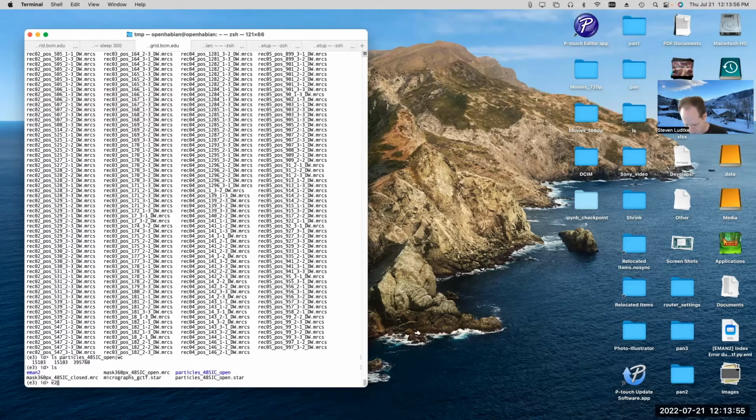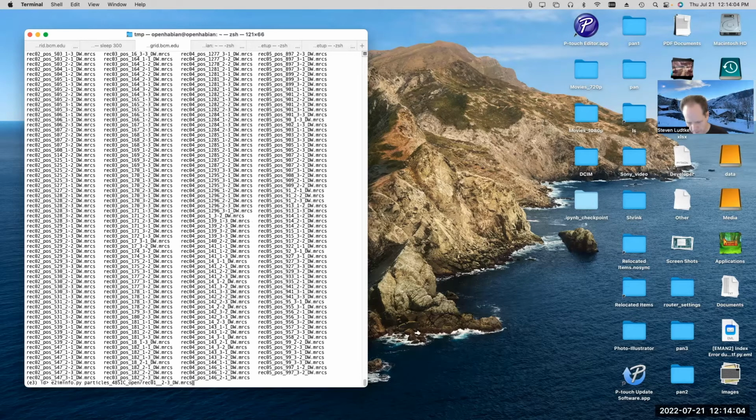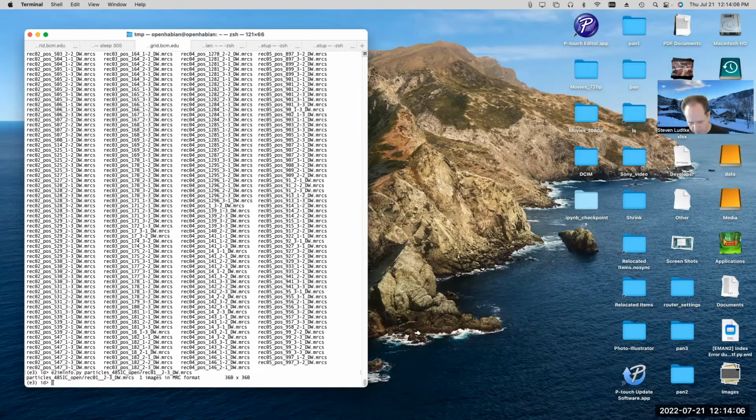If we say e2iminfo particles and just give it one of those files, we can see, yeah, MRC format, 360 by 360. And there was one particle in that file.